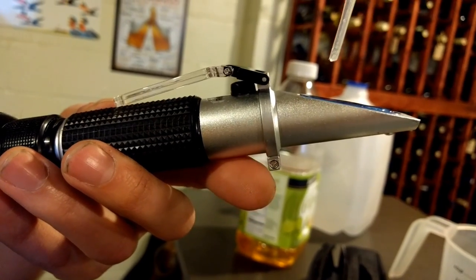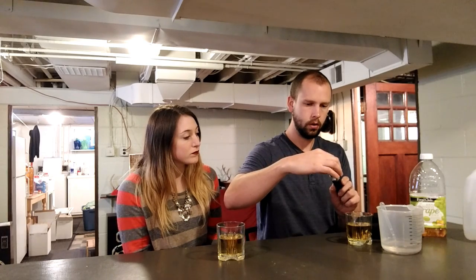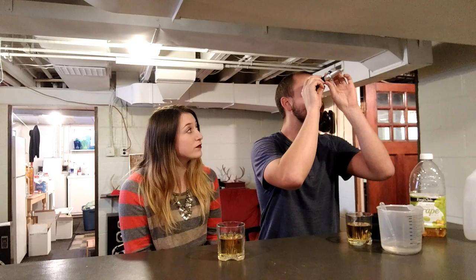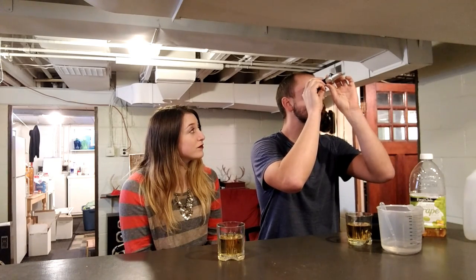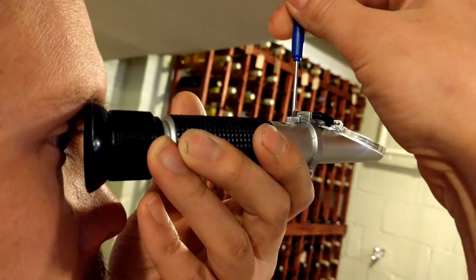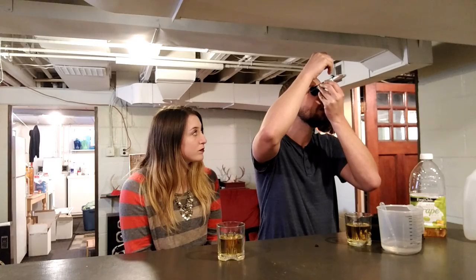So I'll just put a couple drops on there, close it, and it squirts the water out. And then I'll just look up at a light. So right now it's reading just above zero Brix. So I'll take a little screwdriver and adjust the screw until the line matches with zero.